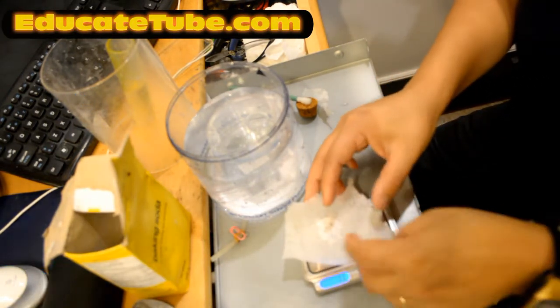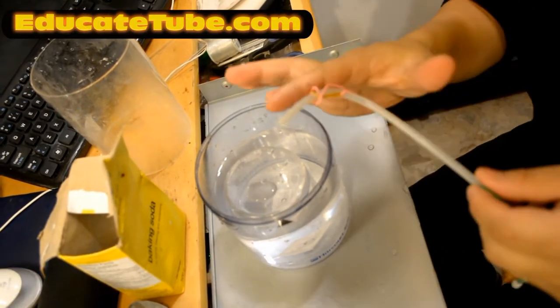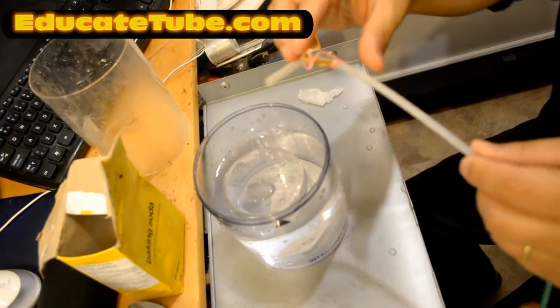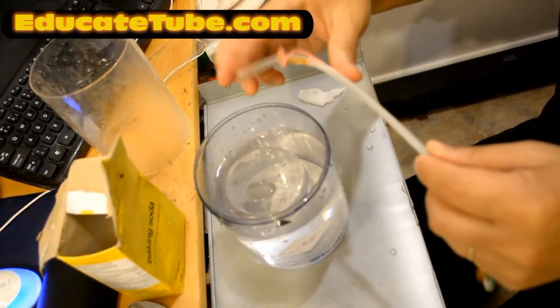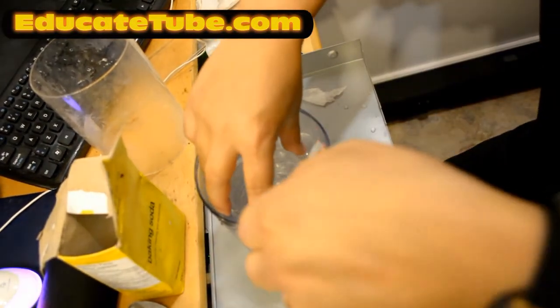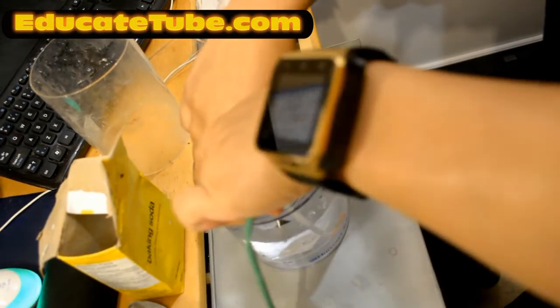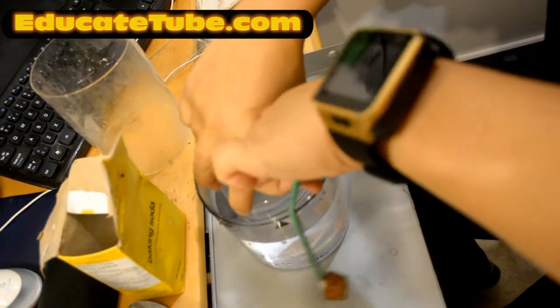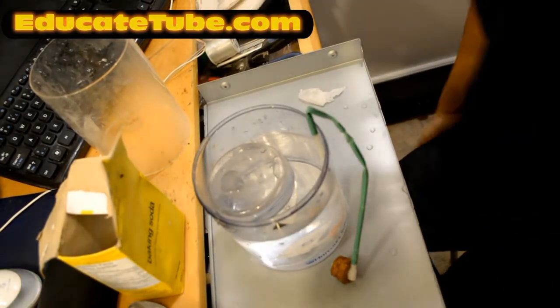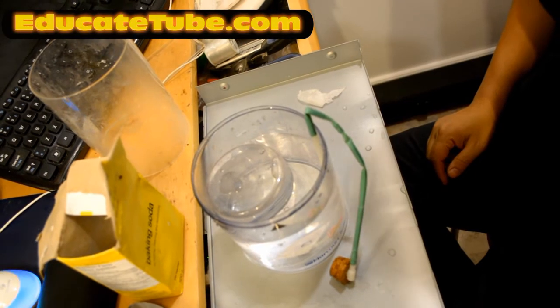1.0 gram. Okay, I modified the tube a little bit so that it curves. I put a paper clip and I twirled it so that it kind of curved this tube here. There's a rubber tube, a plastic tube, and it should fit properly. There we go. Good. So it will stay there. Now let's do this again.